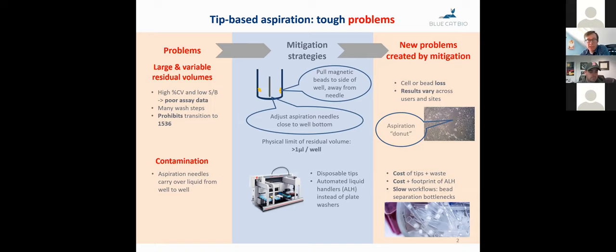So what are the mitigation strategies that people use to get around those problems. So in the context of magnetic bead assays, what people typically do is they pull the magnets to the side of the well away from the needle as a way to minimize the residual volume. And then also you adjust the aspiration needle as close to the bottom of the well to minimize the residual. But that creates its own set of problems, mostly cell or bead loss. Having the beads off to the side is a little bit of a precarious situation. It's very easy to lose beads from that position. And what it also means is that it creates a lot of variability across users and across sites because everybody adjusts the aspiration needle slightly different.